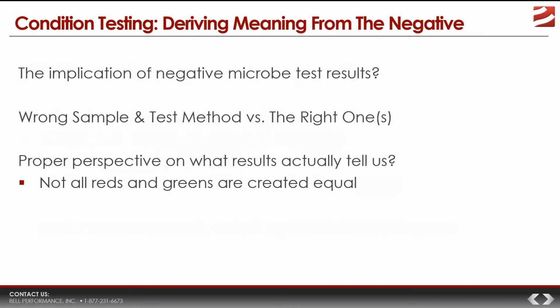one of the takeaways from talking about all this, we have touched on this before, is that it is important for us to keep a proper perspective on the accuracy of the tests that we get and what the real meaning of the microbe tests are that we've gotten. This is because a positive or negative test may not tell us the entirety of what we think it is telling us.